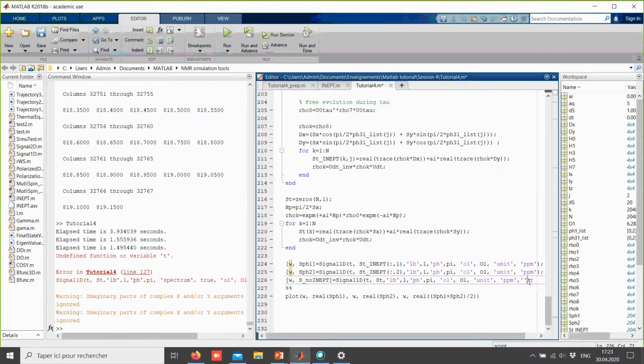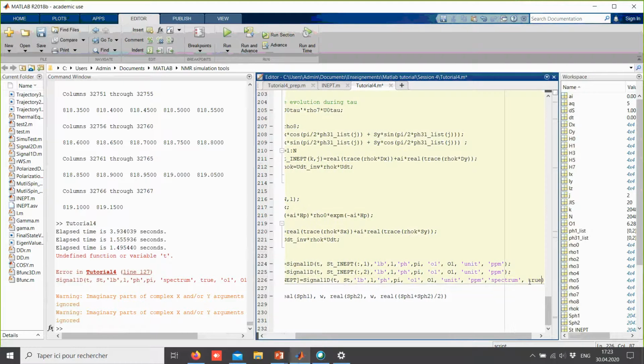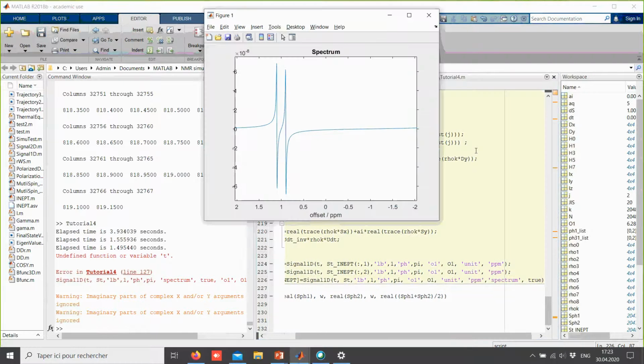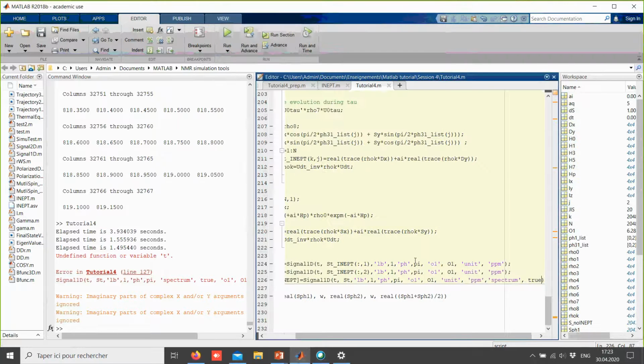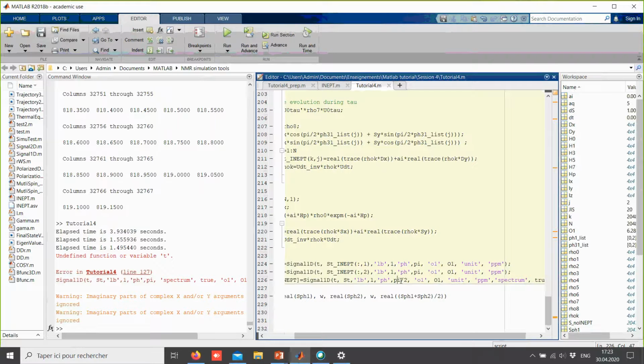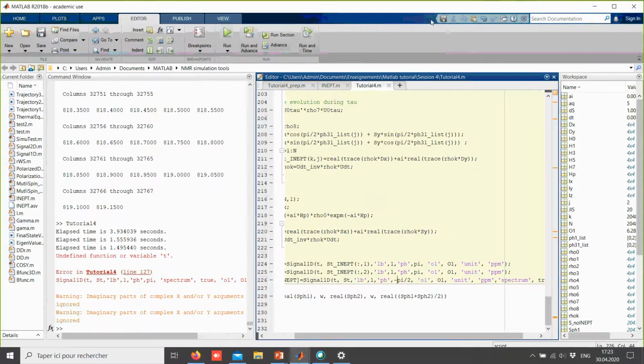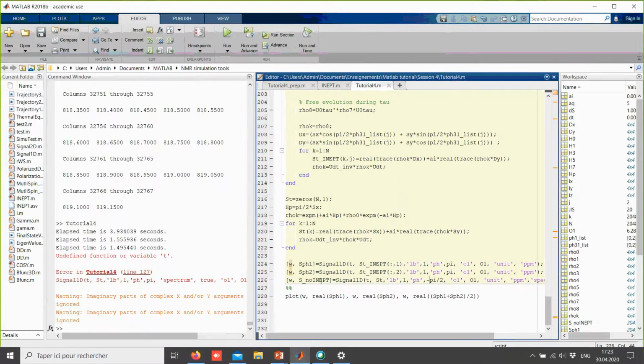Just want to have a look at the spectrum to be sure it is right. So I plot it, run the code. Okay. Just need to change the phase. Yes, this is what I wanted. So now doing this, I saved in here. This is the signal without doing any INEPT, and I'm going to plot it on the same graph here.